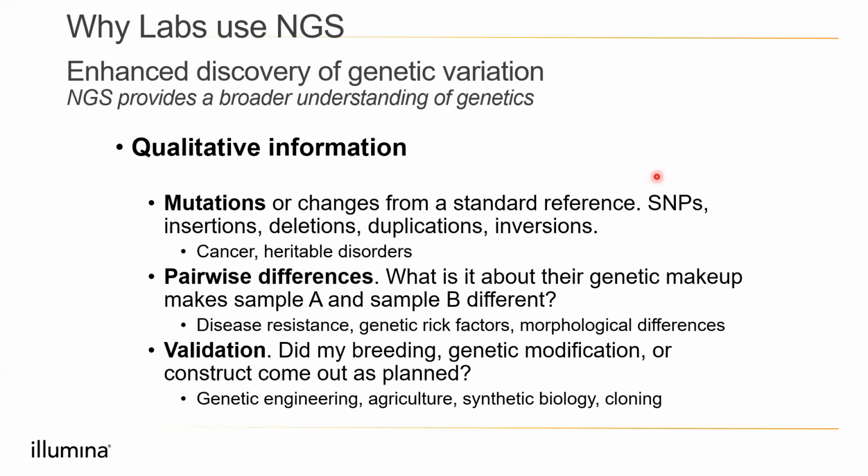As Ashutosh discussed, in clinical applications you can check for germline mutation or somatic mutation. It could be heritable disorders, hereditary cancers, hereditary disorders.